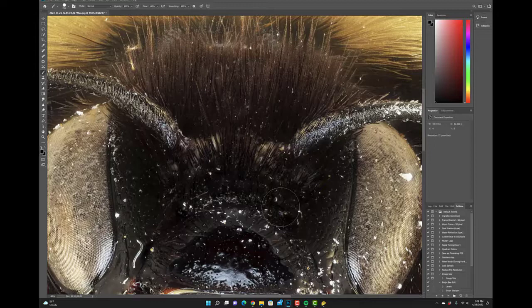There's no reason why you can't go back. You have the specimen catalog, pull the specimen, and use higher magnification to really, spectacularly resolve that region of the specimen.